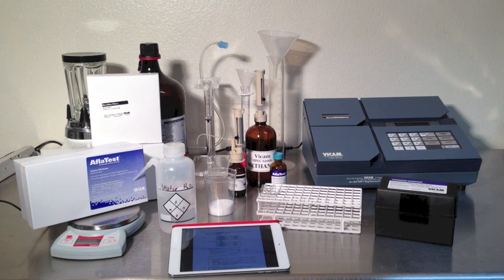First, prepare your test area. The standard test kit package contains all the hardware you need for running the AFLATEST procedure. You will need to provide HPLC grade 100% methanol and purified water. Also, use the current test procedure from the AFLATEST manual.